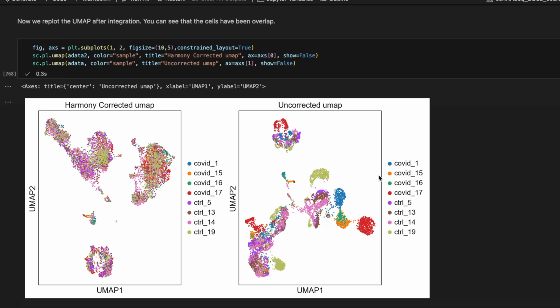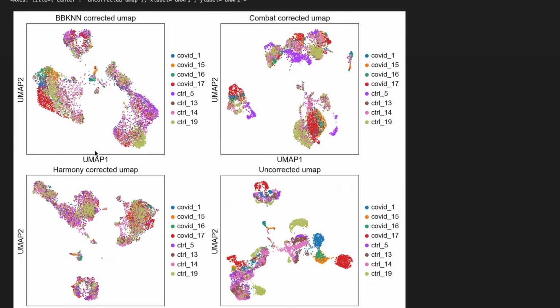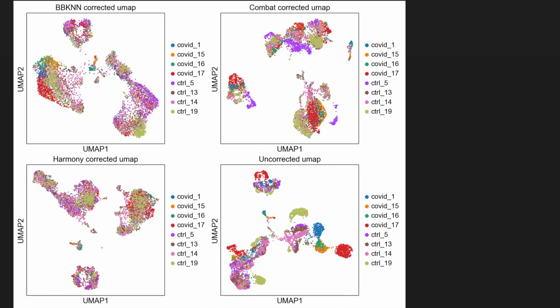integration, and then this is the first picture that we have from UMAP before data integration. So we can see that some of the discrepancies that we have, I mean in terms of separation of the samples in the space with potential batch effect, disappear here. We see a better overlapping among the cells in the UMAP space. Now I jump ahead, and I would like to have a bit more discussion when we are comparing the different approaches.